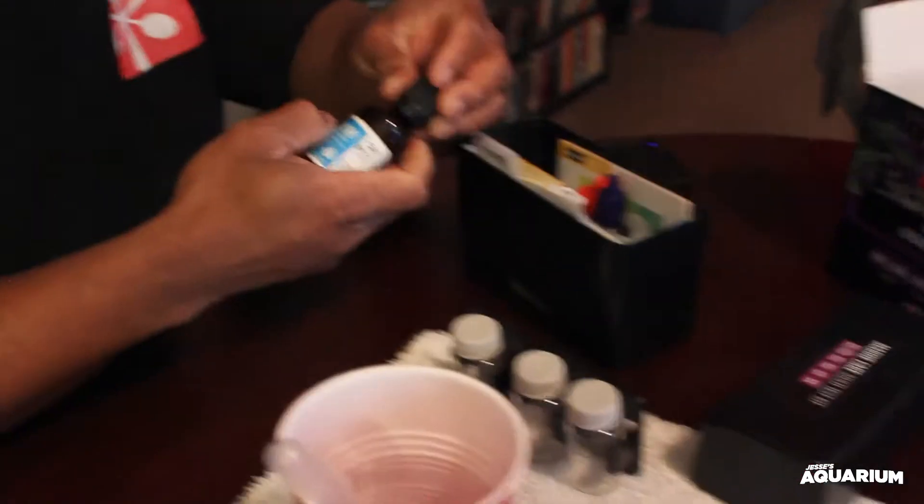Hold the vial and shake for 10 seconds. These titrations do not want to come out of the vial. Now we'll add Reagent B — a level spoon of that. Hold the vial and shake for 60 seconds. And we're done.